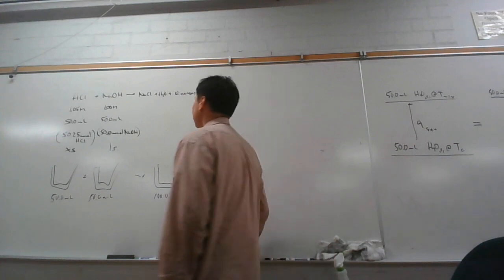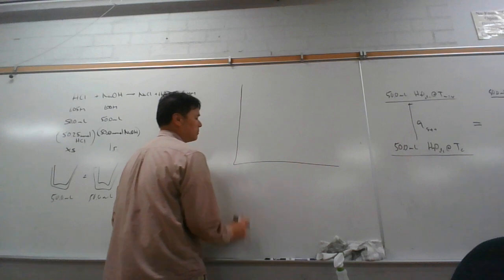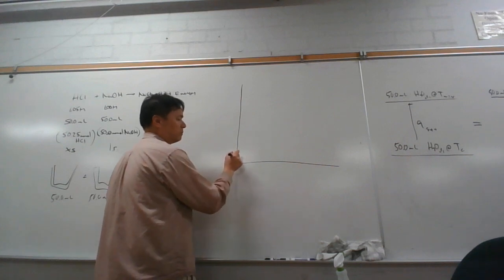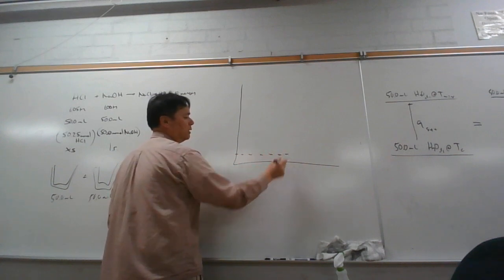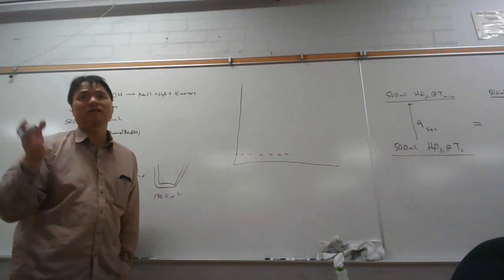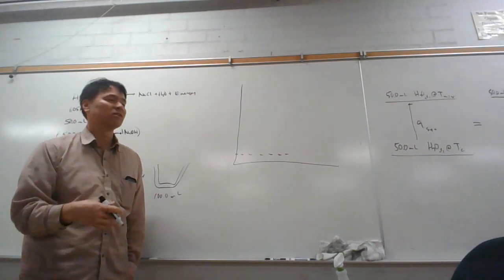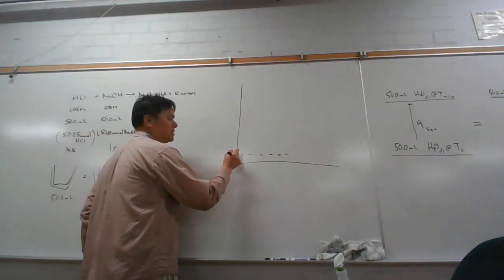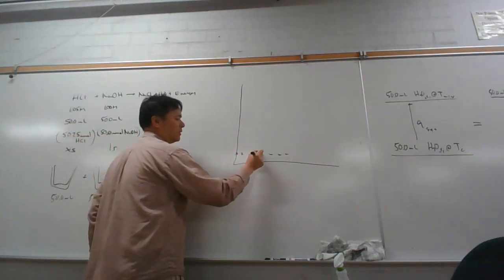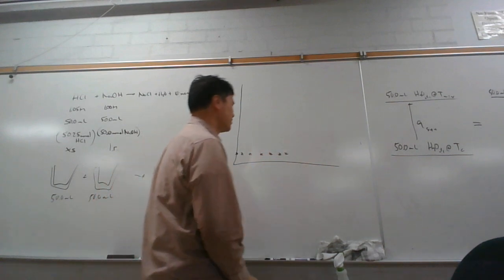Now, the HCl and the sodium hydroxide are going to be at the same temperature or close to the same temperature. They might be slightly off. The reason they might be slightly off is because the probes' calibrations aren't synced. That is, one probe is reading a little high or a little low. If that's the case, you're going to get two lines here, but that's all right. One or two lines. Let's just say my probes are slightly out of sync here.